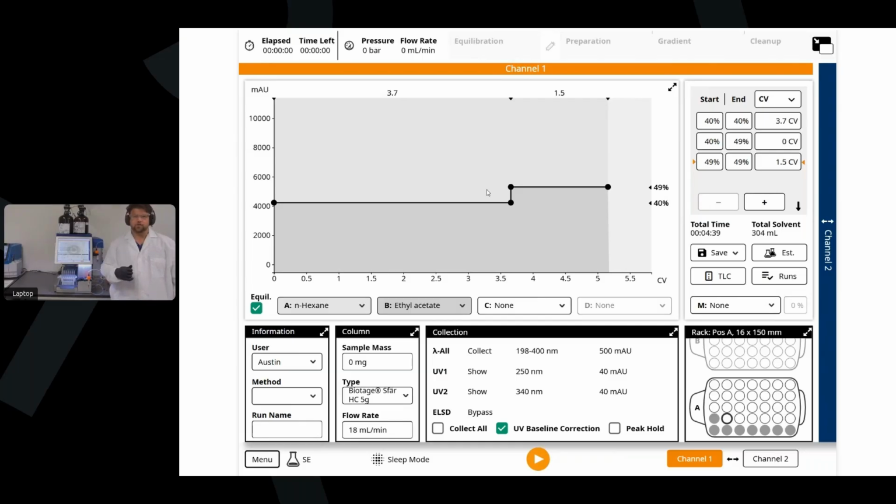But also, with those capabilities, because we're able to get sometimes a thinner band, you're going to have less band broadening, and again, that's going to give you better resolution. So both are possible. I hope that answered that question, but feel free to ask it maybe in a different way. Thanks for sharing insight on loading capabilities.